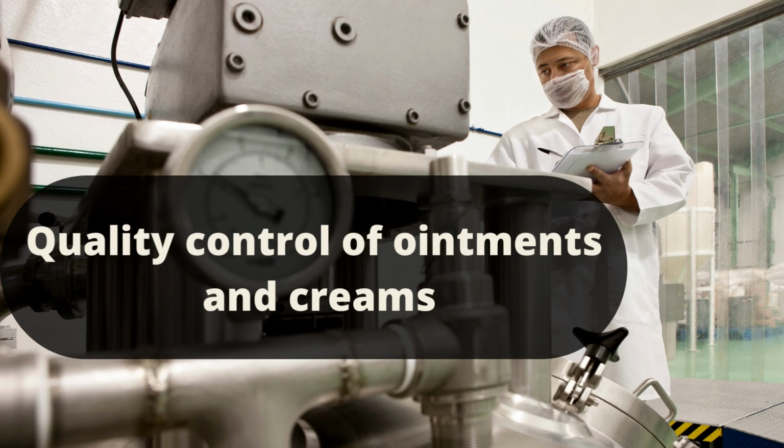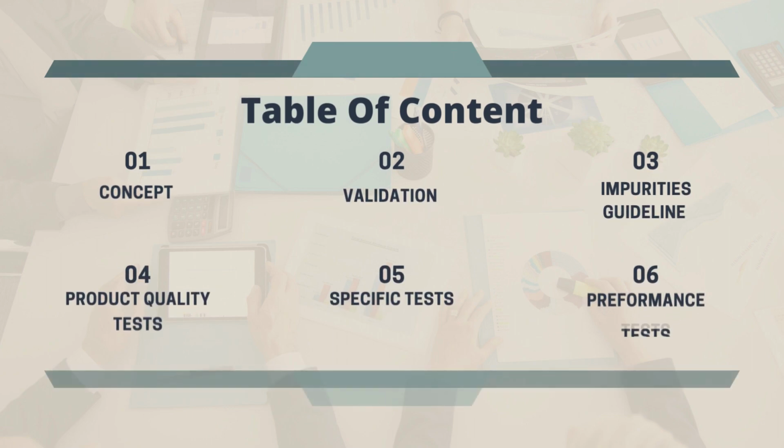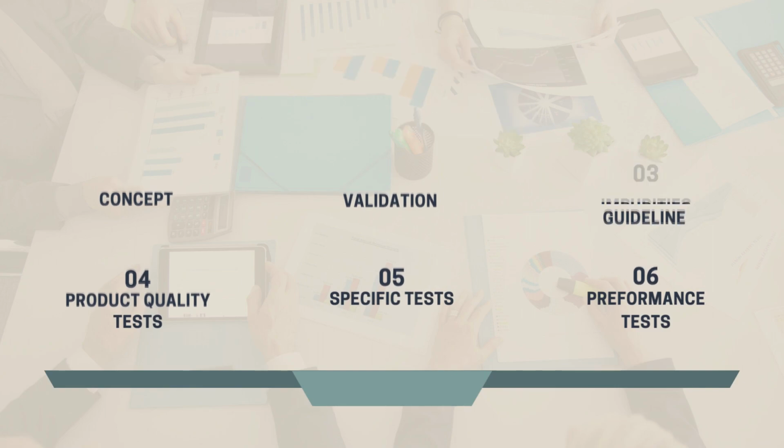Welcome to our journey in quality control of ointments and creams. In this journey, we will stop by 6 stations, starting with the concept, validation, impurities guidelines, product quality test, specific test, and performance test. Firstly, we will start with the concept.